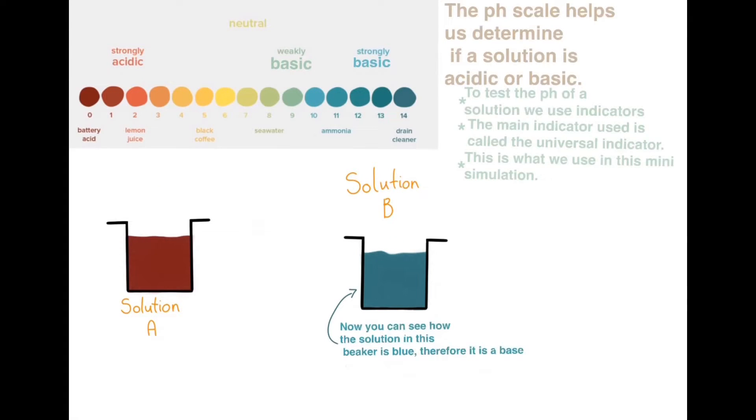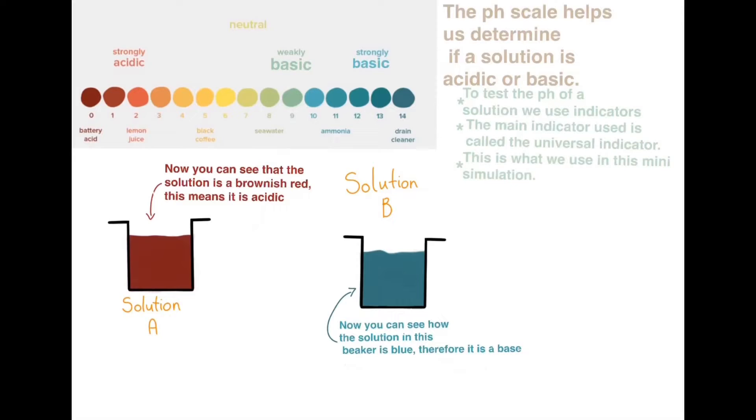Now you can see how the solution in this beaker is blue, therefore it's a base. Now you can see that the solution in this beaker is a brownish red. This means that it is acidic.